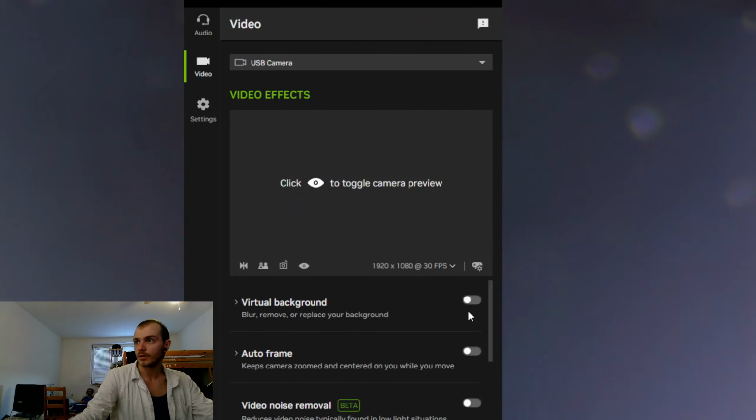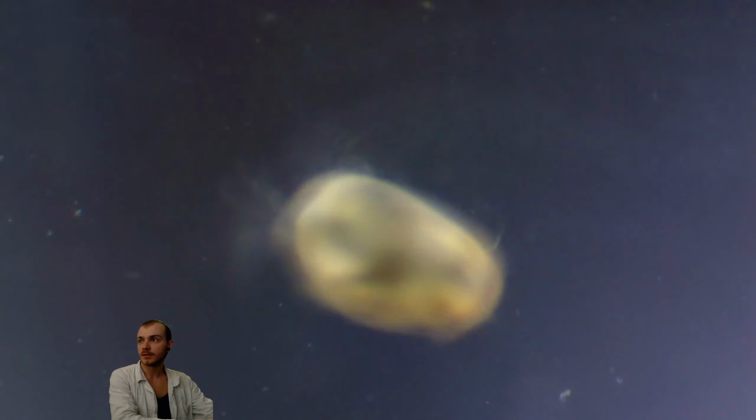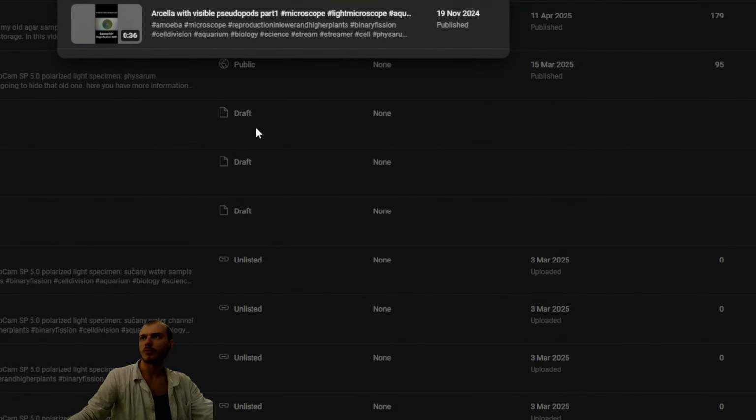And we have like 3 ostracods. Again, we have too much water here, so it will be hard to find something steady. But this was it. I'm gonna start the recording. I forgot which one is observation 5. Okay.